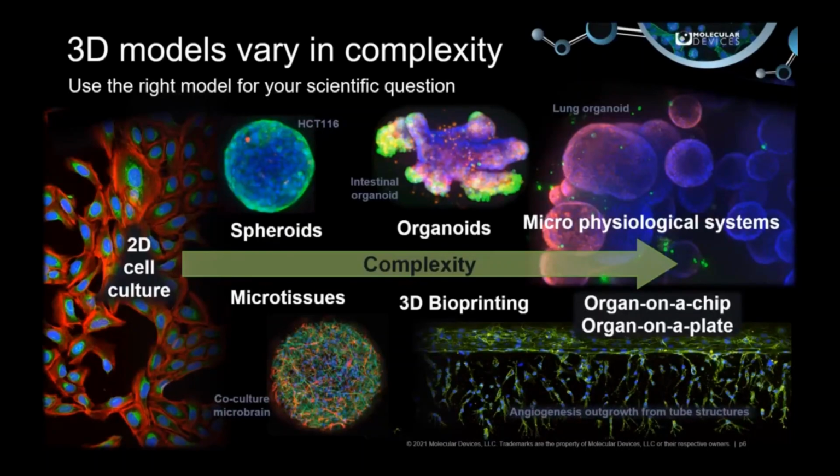Similar to this, there are tumor-like organoids, which model the tumor microenvironment. And we see other examples where scientists are really pushing the level of complexity with the use of organ-on-a-chip technology, maybe including microfluidics, pressure, stretch, or other organ interactions. And all of this is balanced against the investment of time and resources and expertise to get the appropriate answer from the system that you're working with.